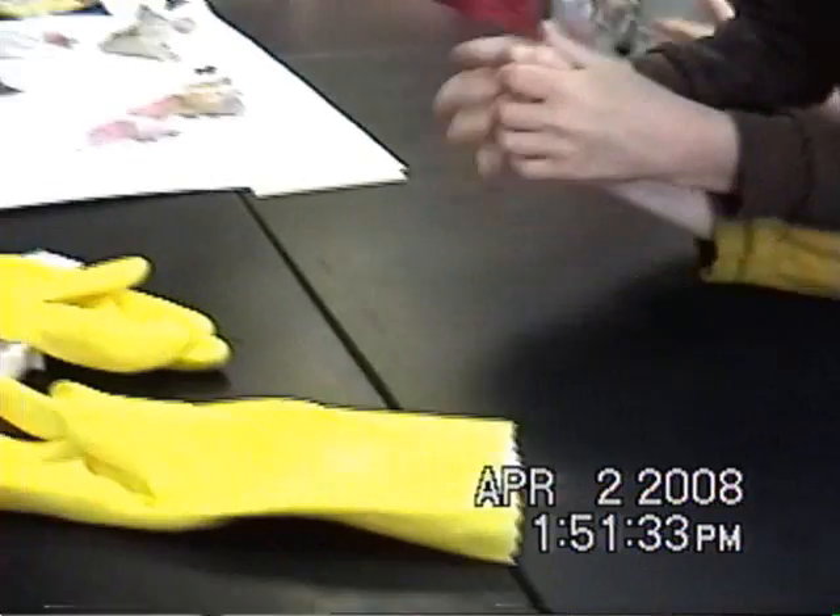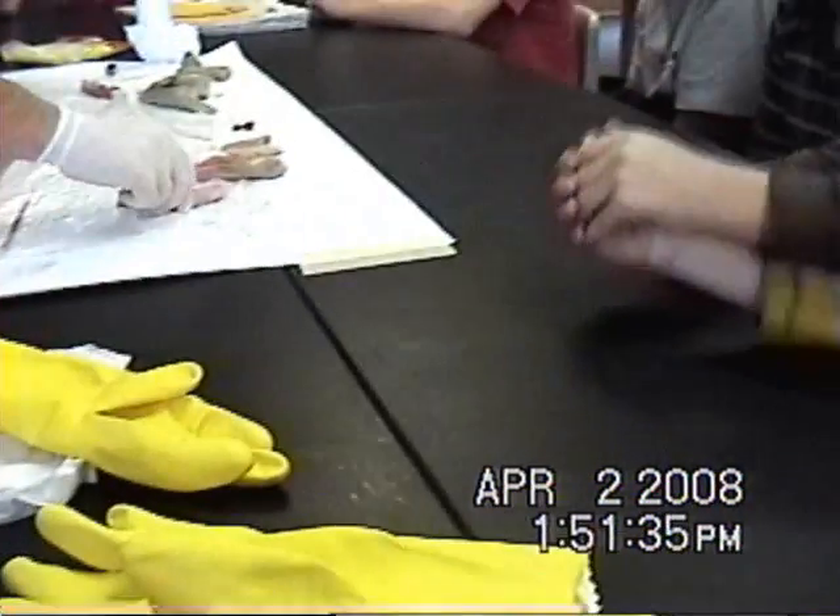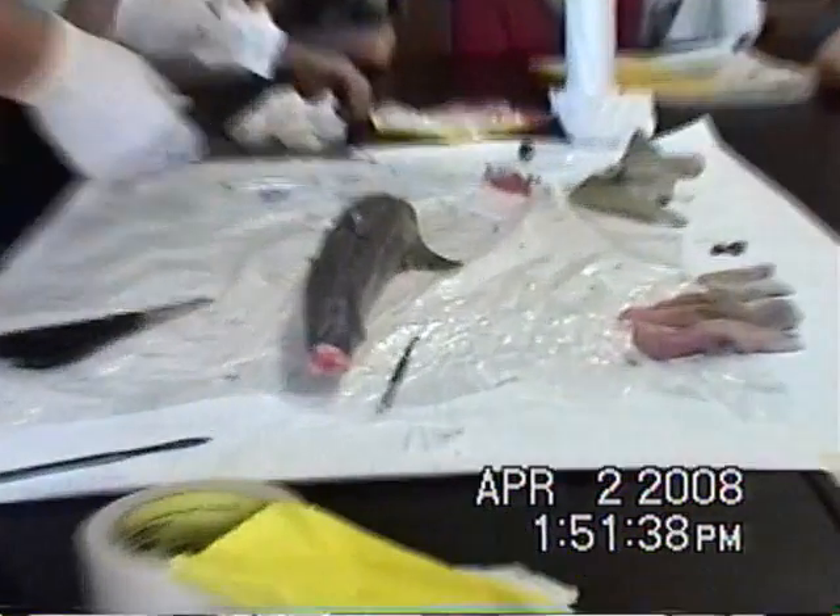Brain time! Stop fighting over the lens. It's just a lens.